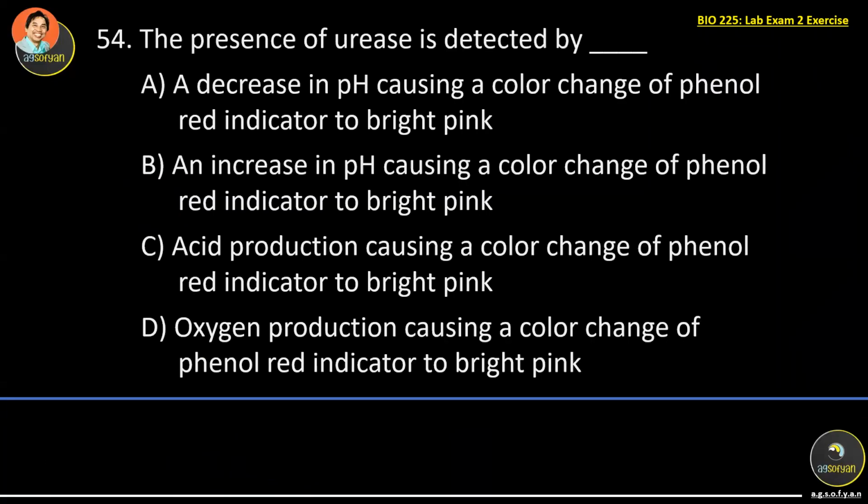The presence of urease is detected by what? So we just mentioned the color change over here. So what is happening here? What is the answer? Okay, so look at the bright pink. Oh, all bright pink. So that's all the choices over here. So the color is correct over here.